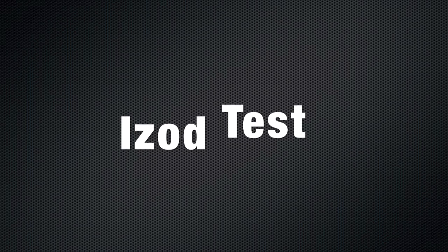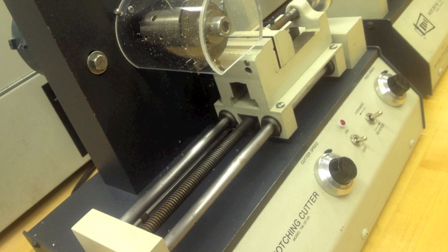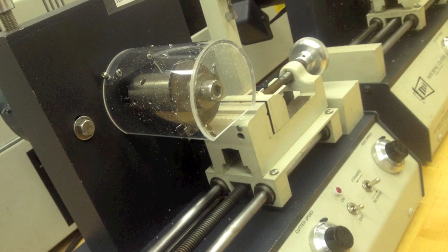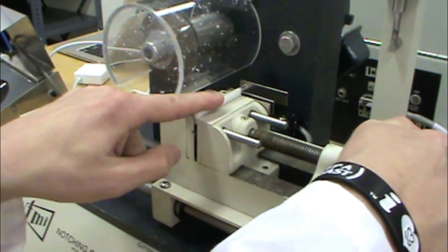We'll first begin by explaining the procedure for the Izod impact test. The test specimen for the Izod test should measure 2 1/2 inches long and 1/8 inch thick. In order to test a notched sample, it has to be notched by cutting it on one of the Testing Machines Incorporated notching cutters. This is done by loading the 2 1/2 inch long sample into the vise on the right hand side of the cutting machine on edge like shown.